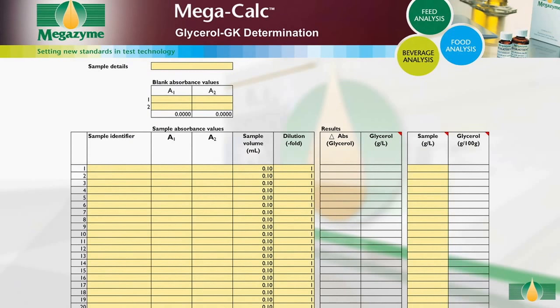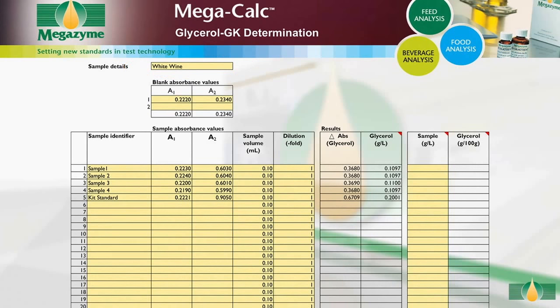Open the MegaCalc worksheet and input the following: sample details and absorbance readings for the blanks. For each sample, input the sample identifier and the absorbance values. Alter the sample volume if a volume other than the default 0.1 millilitres is used. If dilution of the sample has been performed, input the dilution factor used; if no further dilution was performed, the dilution factor is 1. When all of the data has been entered, the concentration of glycerol in the sample is automatically calculated and given as grams per litre in the original sample. For solid samples, input the concentration of the original sample extract in grams per litre, and the concentration of glycerol in the solid sample is then automatically calculated and provided as grams per 100 grams in the original sample.